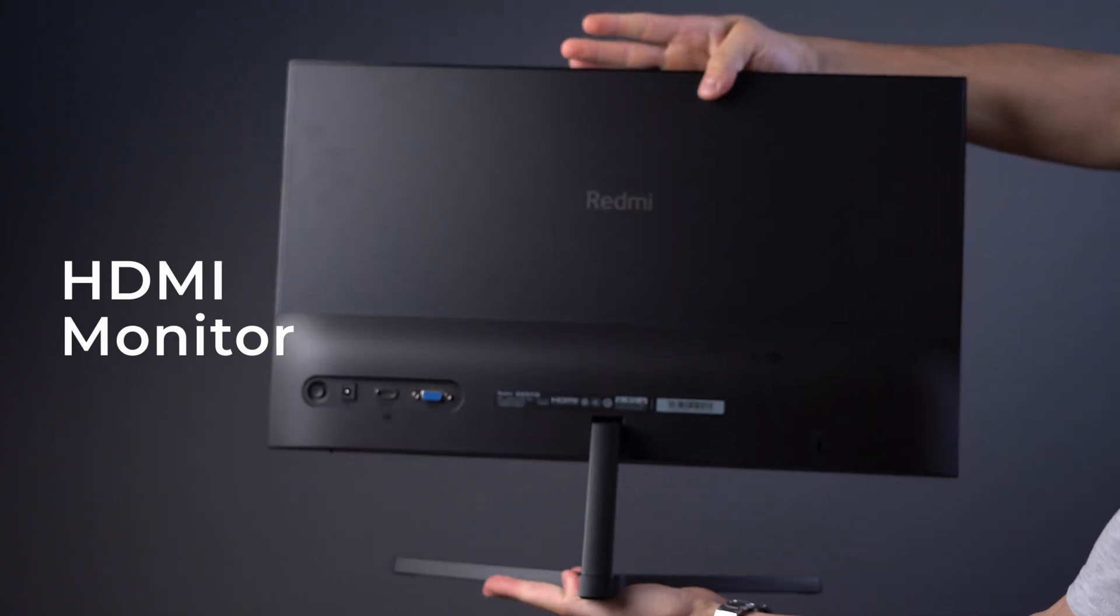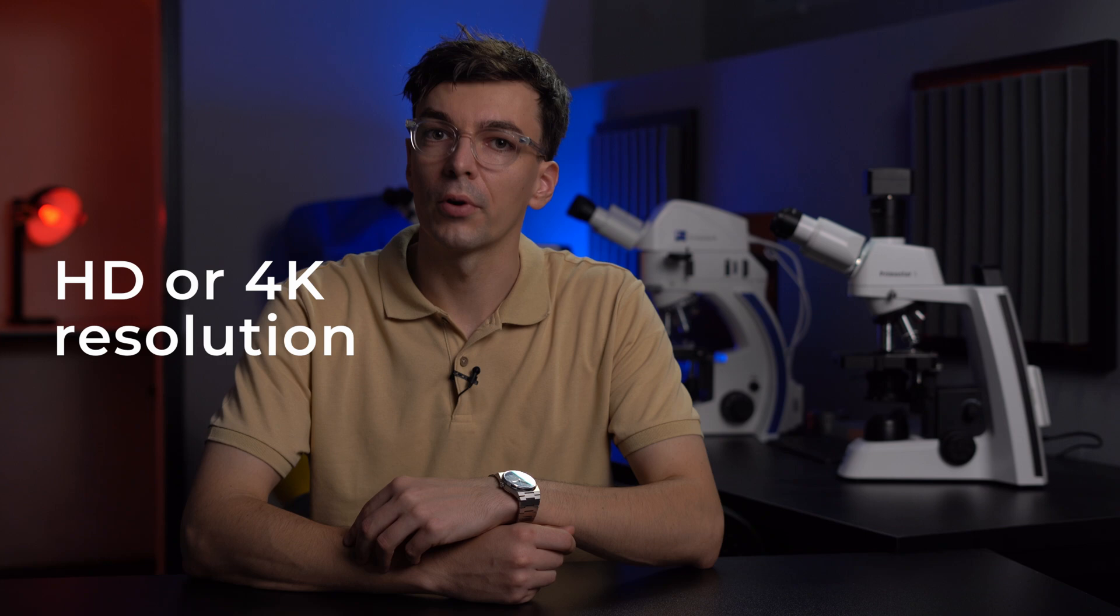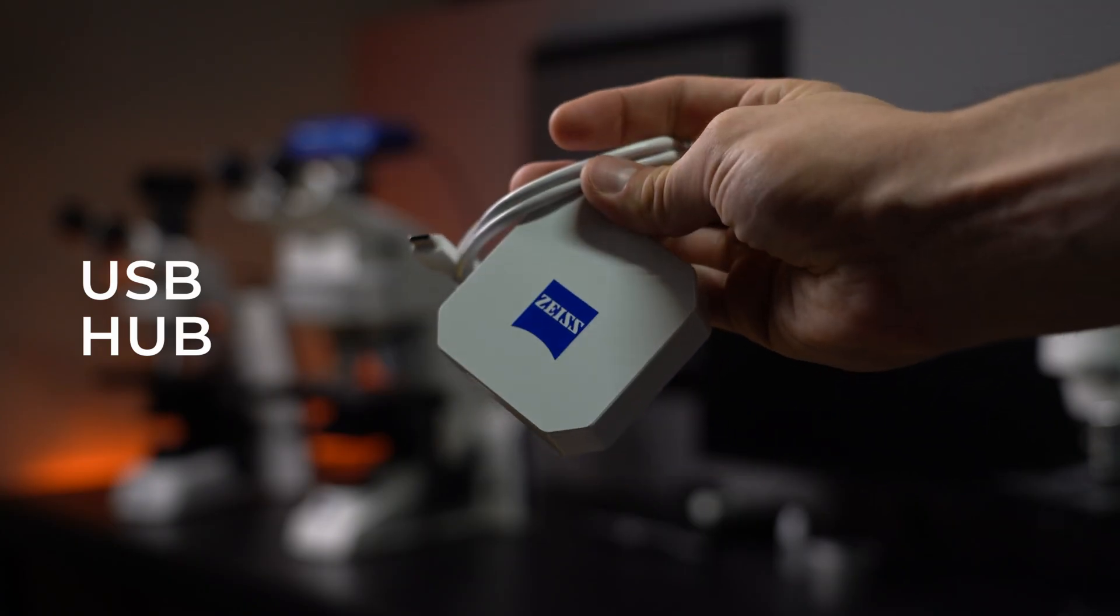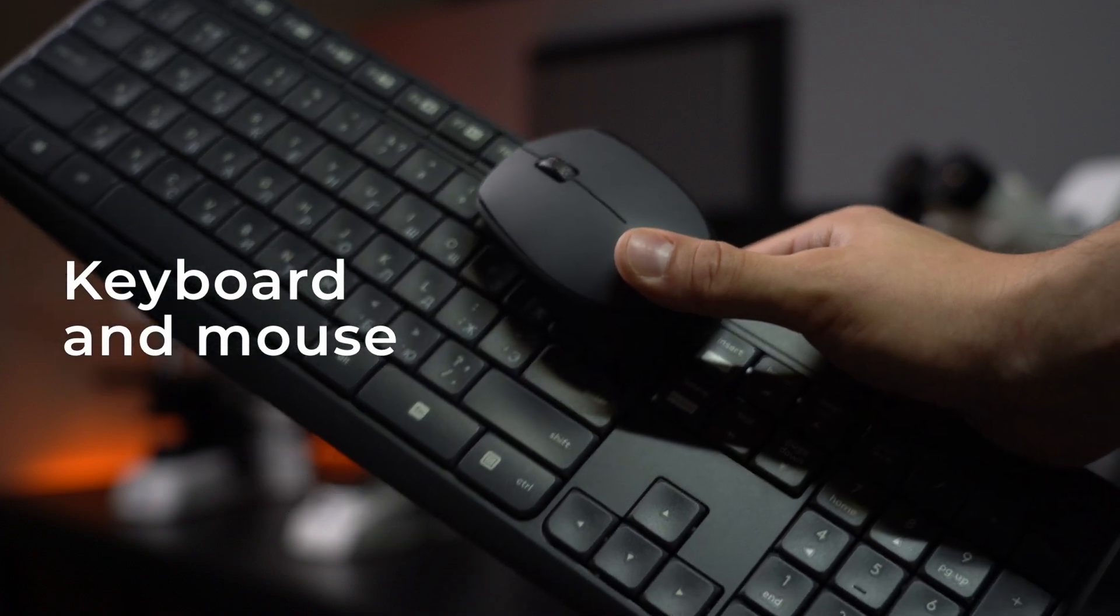Second, a monitor with HDMI connection, HD or 4K resolution. Third, USB hub included in the camera accessories. Fourth, keyboard and mouse.